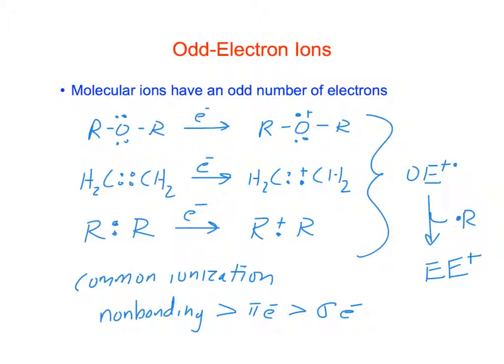And that really depends on the fragmentation mechanism. If we're cleaving just one bond into 2 pieces, then we get even electron ions. If the cleavage involves some type of rearrangement, then we'll get a fragment ion that's an odd electron ion, and that will be something that we can identify and will mean something to us when we see that.